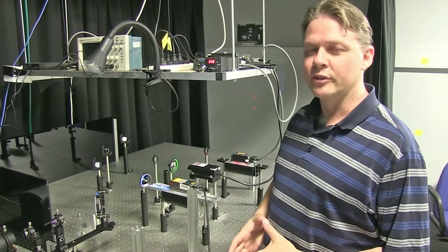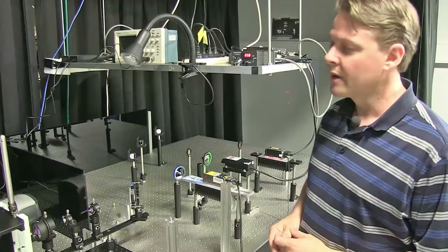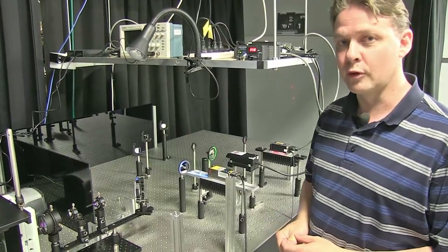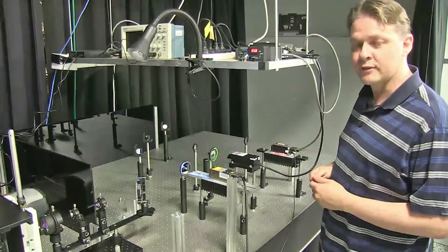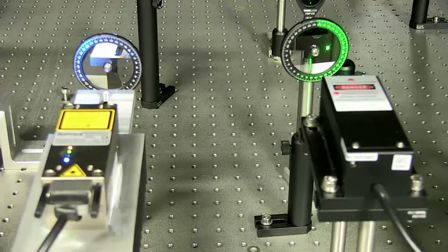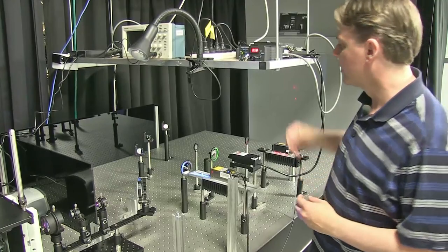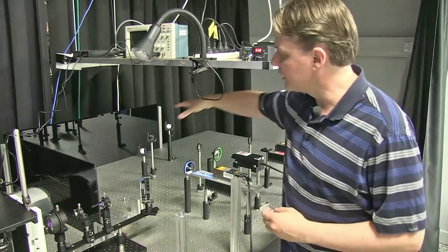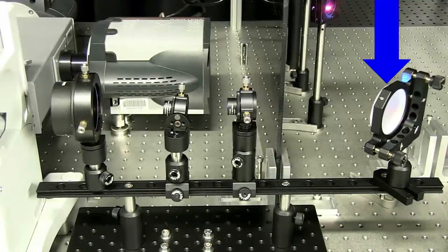So this is the setup that we do single molecule localisation microscopy with. It's an inverted fluorescence microscope capable of detecting emission from single molecules. Excitation is provided by continuous wave diode lasers. We've got blue, green and red and each of these can provide about one to two hundred milliwatts. The light from the lasers is steered around and collected on these dichroic mirrors here and brought to this mirror here.